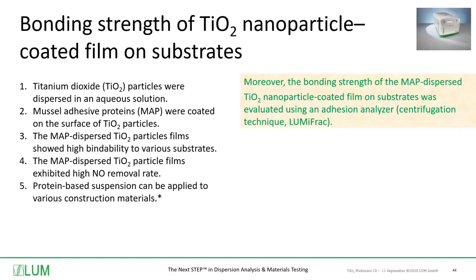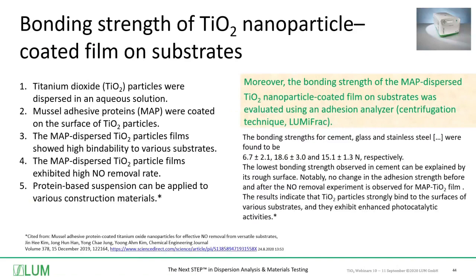And here they use the LUM technique and the LUM instrument called LUMiFrac to determine the bonding strength of the nanoparticle coated films on several substrates. I don't want to go too much into the details and into the numbers here. You are very much welcome once more to download this article from the internet.